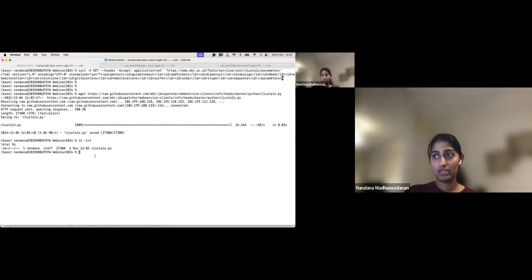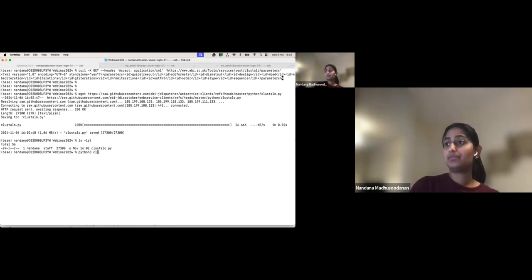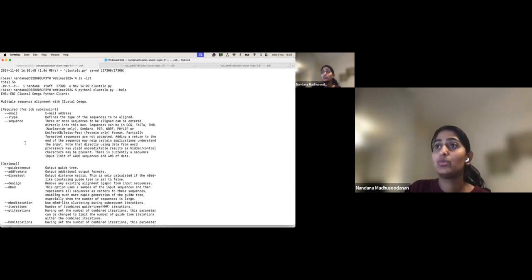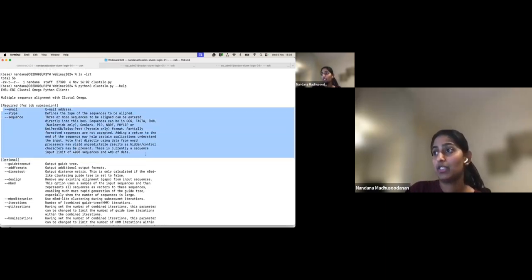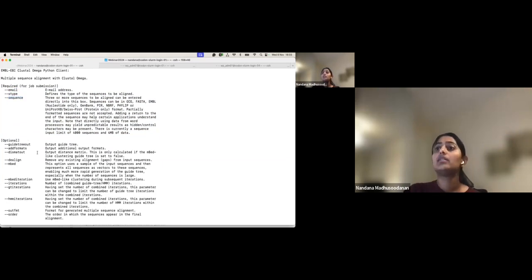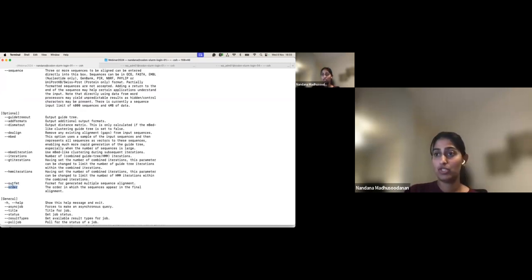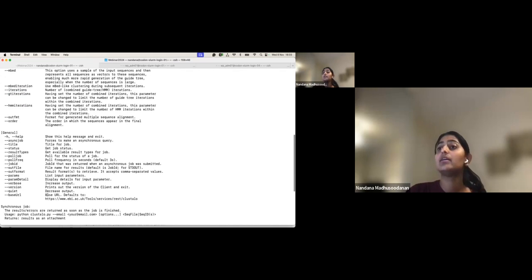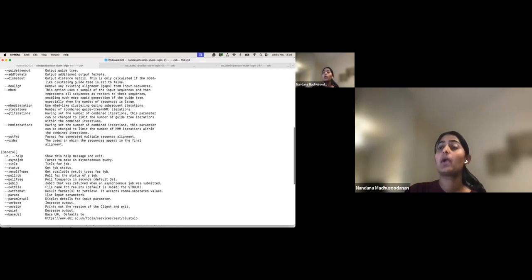To see the help for this client, run it with the --help flag. You can see it's a multiple sequence alignment tool, and the required parameters are: a valid email address, sequence type, and the sequences. Optional parameters include order, output format, number of iterations, and more.